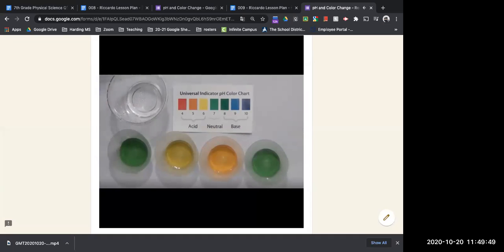Finally, more citric acid solid is added to the citric acid solution and the cup is swirled so that the citric acid can dissolve. So this one should be red. We'll add 1 drop of this strongest citric acid solution to the universal indicator. See? It's like reddish orange. What is the pH of the strongest citric acid solution? All right, it's red. So it'd be like a 4.